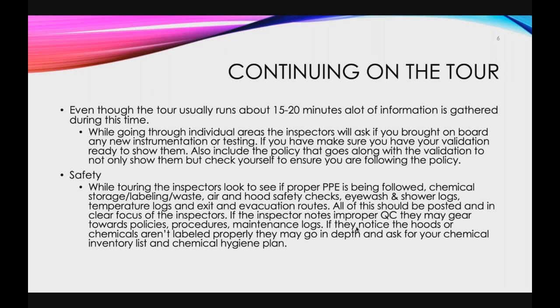Being organized and having all information in a clear and upfront manner creates a positive atmosphere for both you and the inspector. What I tend to do is, for each new instrument, any new validation has its own little binder. It doesn't have to be anything fancy, but it has a summary page. It has what the testing is, the policy and the competencies and the training of everyone. And it's in a little binder, and I have it waiting so that after the tour, they come into wherever they're going to be seated at, and I give it to them.